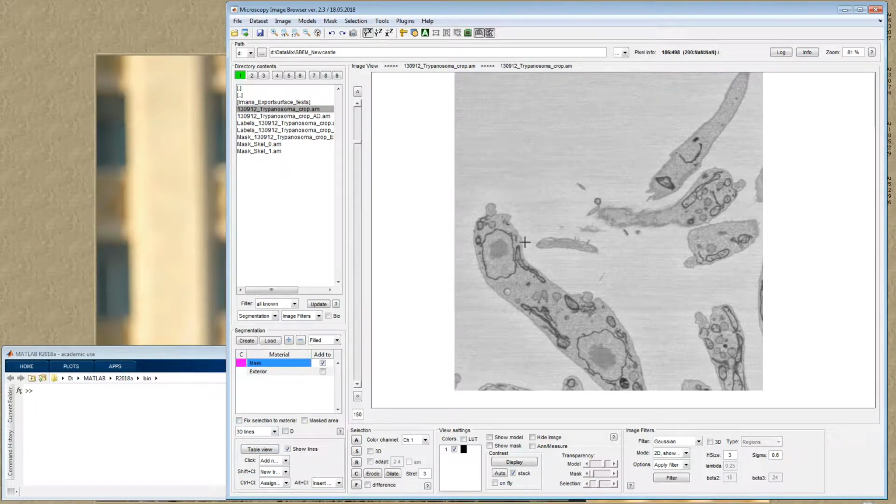To start working with the tool, basically what you need to do is just use your mouse clicks. And then you can see that while you're clicking, you generate the segments, and the segments are growing. So this structure that we have here is called a tree, and it's made of these nodes, which are these yellow points. These points are connected with lines, which are called edges. So when we do this, we can generate these trees, and we can also measure the length between the points for each of the trees.